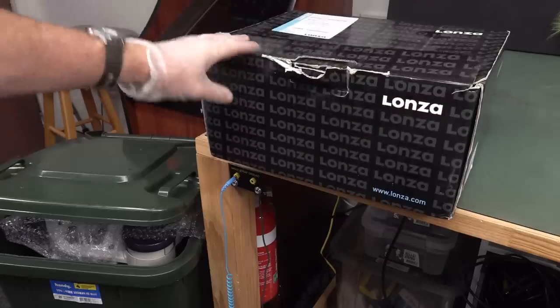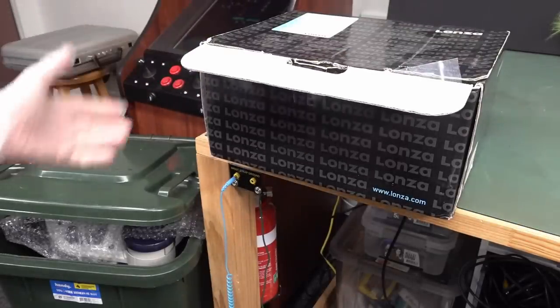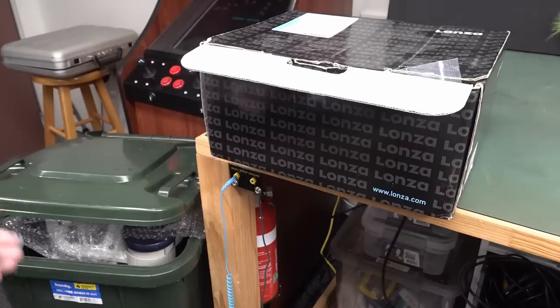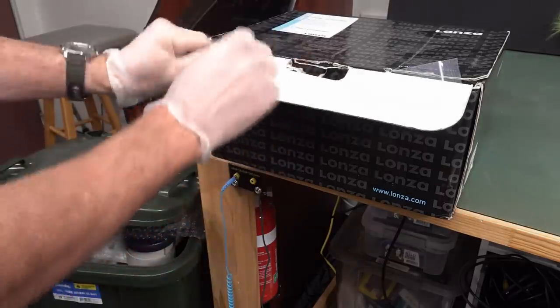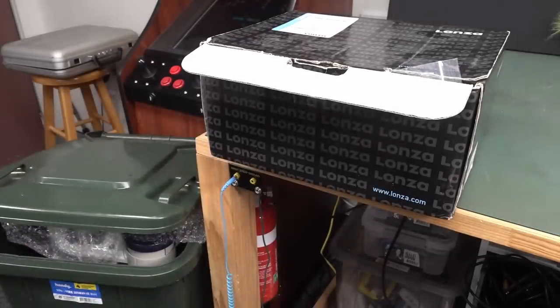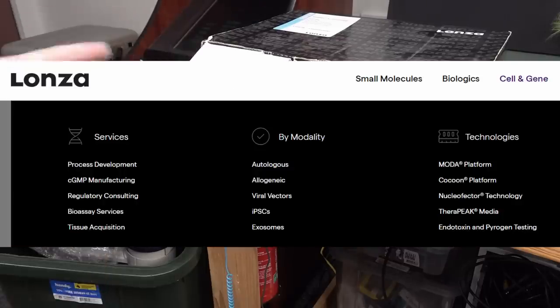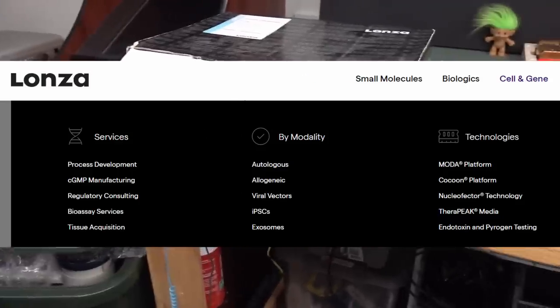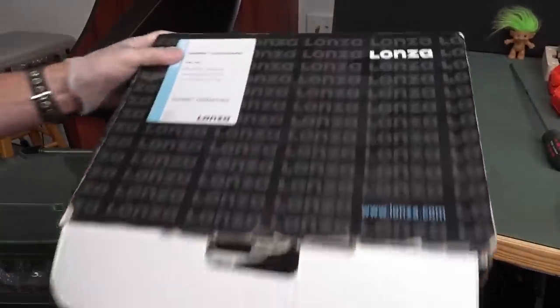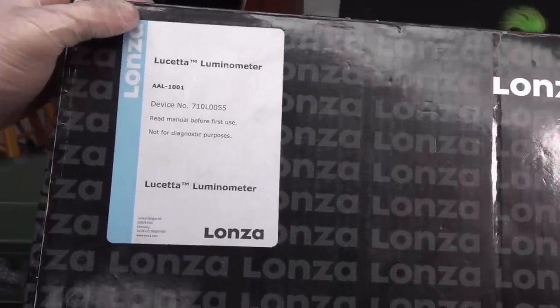It's from a company called Lonza, and a quick check shows that this is a Swiss company that make all sorts of medical things, hence why I've got the gloves on just in case, because there might still be some human waste in this bin or something. But I'll put up a list of stuff that they do. I'm going to pronounce all these things wrong, I'm sure, but what we've got here is a Lucetta Luminometer?